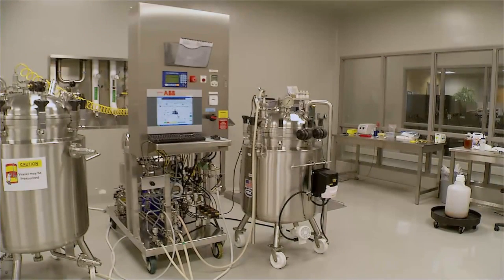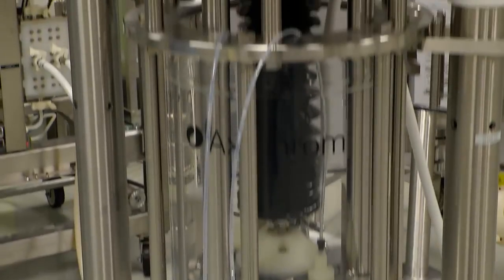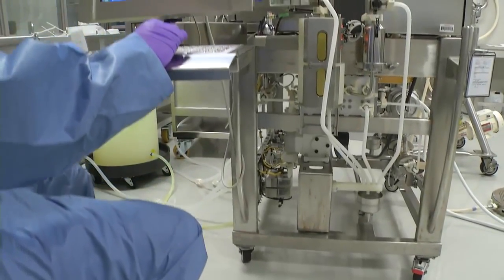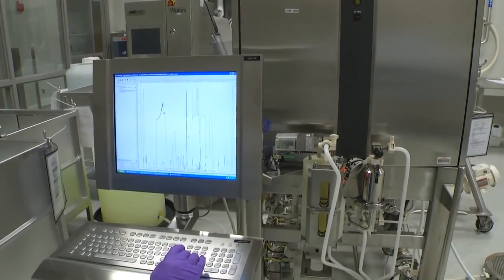The clarified lysate is pumped into a vented, temperature-controlled transfer vessel. This lysate tank then moves downstream to the next series of process steps, purification, where dissolved impurities are removed from the GFP solution and GFP is subsequently concentrated and stabilized.